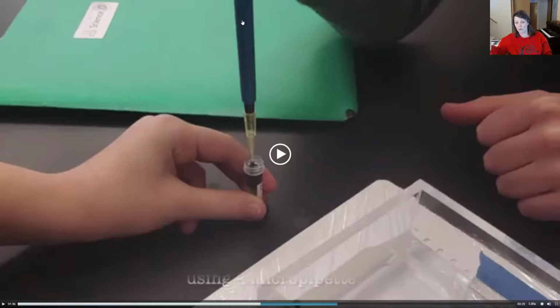Then you are going to go over to the gel, get your tip into the indentation in the gel, and you're going to press all the way down to the second level. Then you are going to lift the micropipette out of the gel before you let go of the button. If you let go of the button while you're still inside the Jell-O, you're just going to suck that ink back up again.